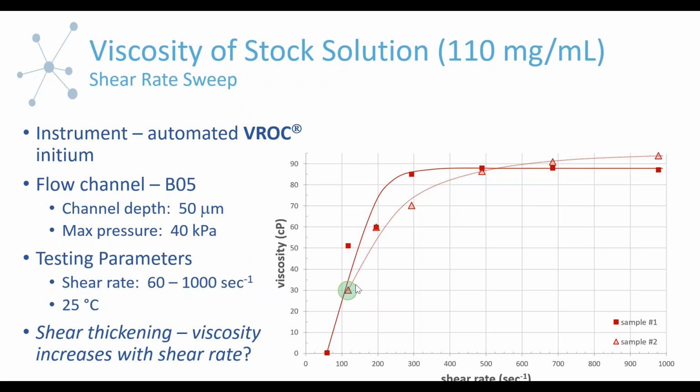So I took the data at a shear rate of close to about 120 inverse seconds, which I've highlighted here with the circle. And so let me just point out now that in addition to this average viscosity value, which the software puts out for you, there's a lot of detailed information that's also constantly being put onto the screen when you're doing the measurement, and then you have access to it once the measurement is done, and you can go in and look at the details of what's happening.